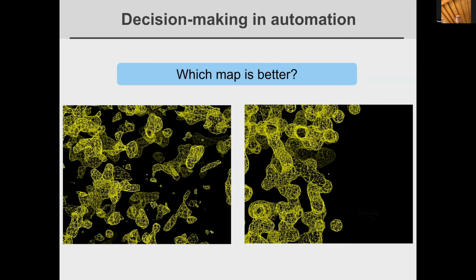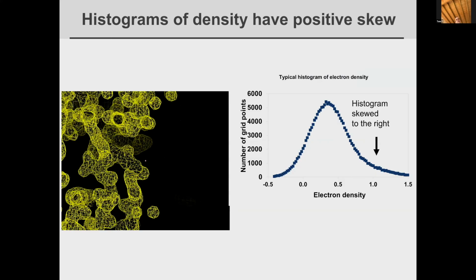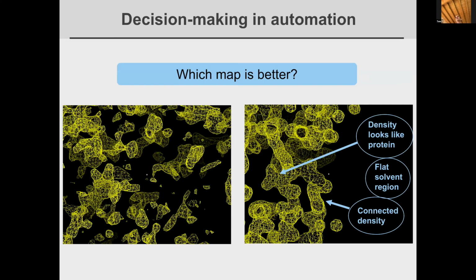And Nigel, if you click down, there's one more button or something, it'll put some of the ones that they said, but actually people got more than the ones I mentioned here. The main point at this, yeah, let's stop at this one. The main point here is you can look at this, you know which one's good. And there's specific things you can say about them that let you know that one is much better than the other.